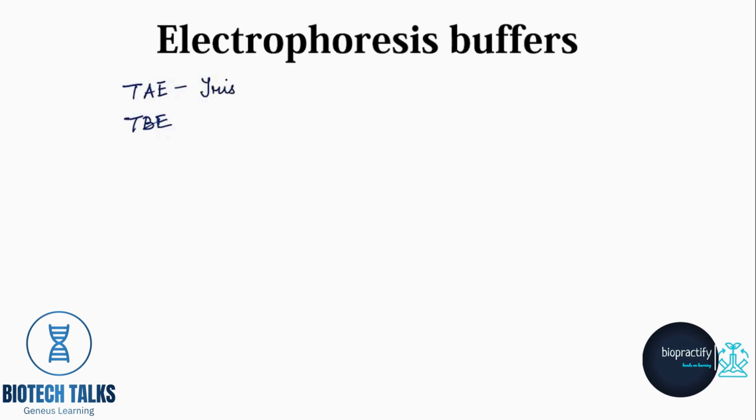TAE stands for tris acetate EDTA, whereas TBE stands for tris borate EDTA.